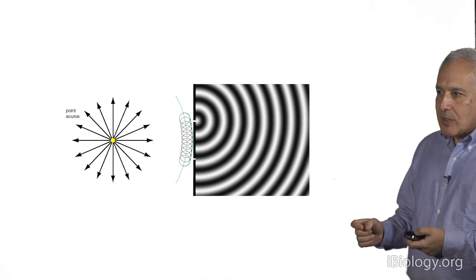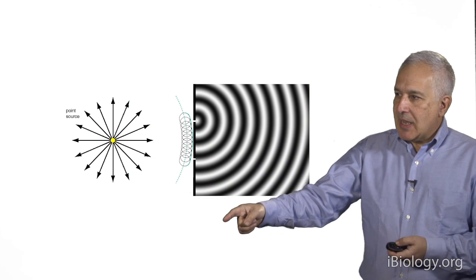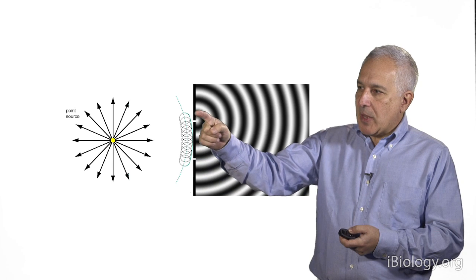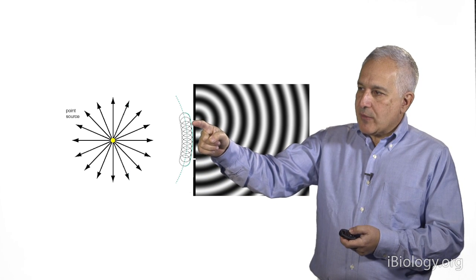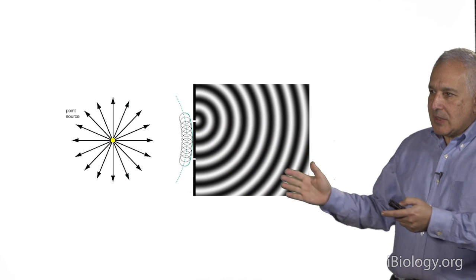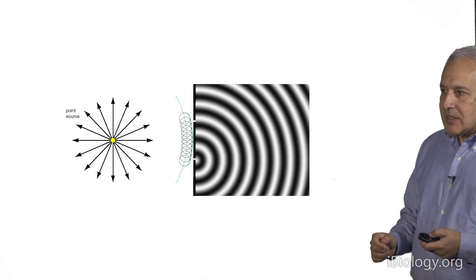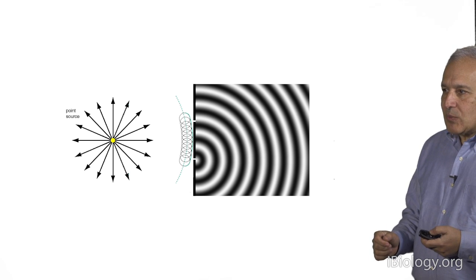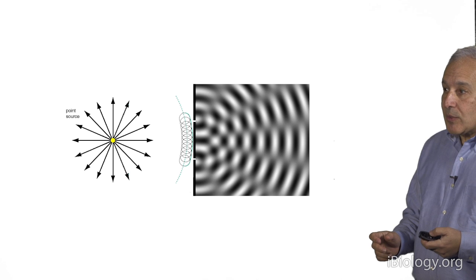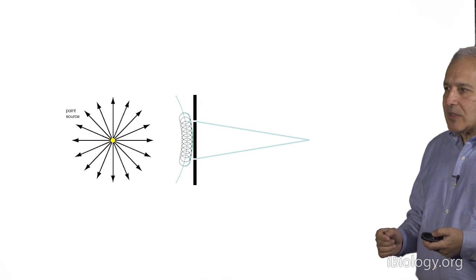So if we have a light source, as shown, that's sending out its light in all directions, and then that generates a spherical wave made up of a bunch of wavelets, one of the wavelets might go through a slit here and generate a pattern of a wavelet on the other side of that pinhole. There's a second slit in that box, and there's a second wavelet that's gone through. And together, those wavelets interact in ways that either add or subtract from each other. And there is that interaction pattern. So let's look at that pattern in a little more detail.